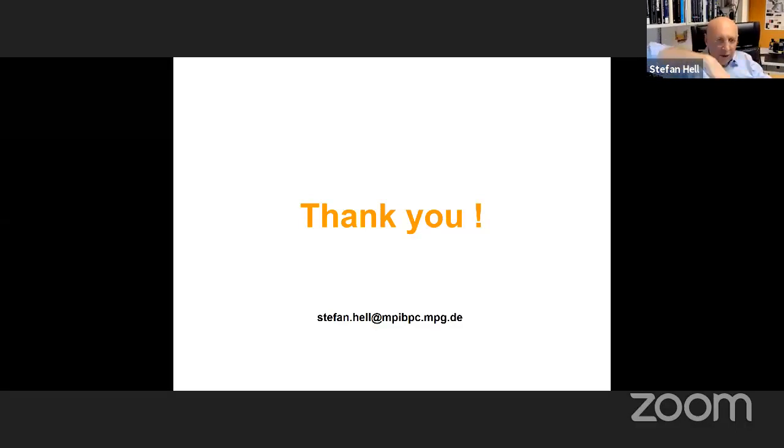And of course, if you make a photon-by-photon decision, as is done in the MINSTED implementation, which can also be done in MINFLUX, though it hasn't been done yet, then arguably you have more reliability. My tendency is to think that the photon-by-photon decision is superior, also for fundamental reasons, but we will see. Also for MINFLUX, I think it is very unlikely that the three points are going to be the end of the story. If you develop something, you have to start somewhere and try it out in one way until you understand what is possible and what not. And then with time, things are refined and getting better.